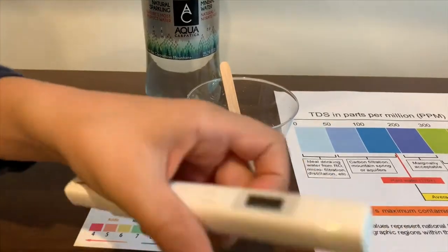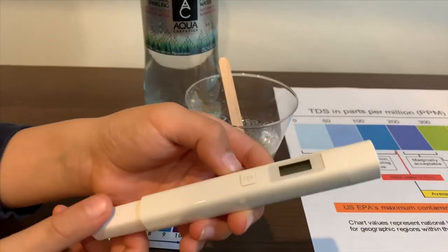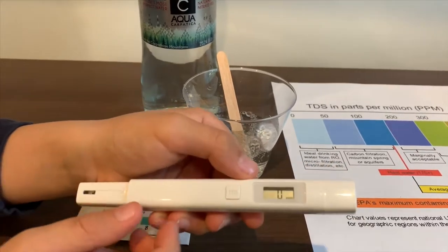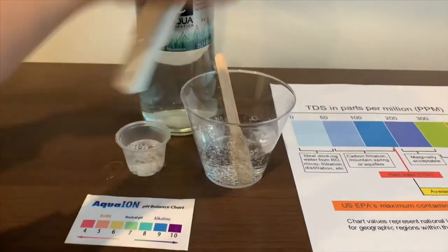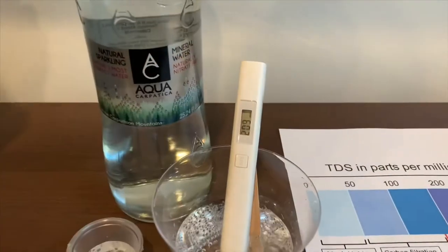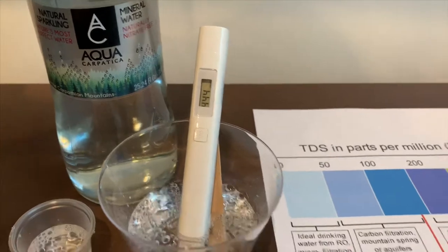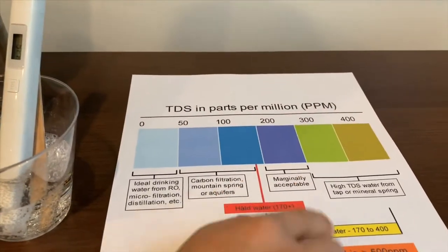If you want to buy this TDS tester, check the link down below. Turn on the TDS tester, make sure it says 0, and put it in. And it's in the 400s — that is average tap water.